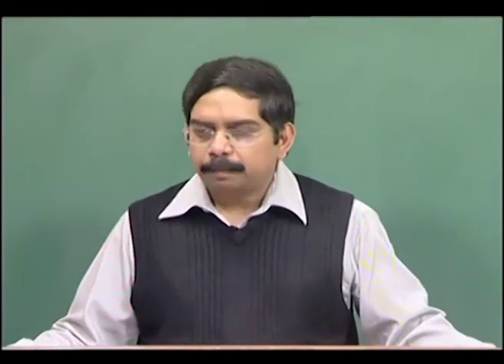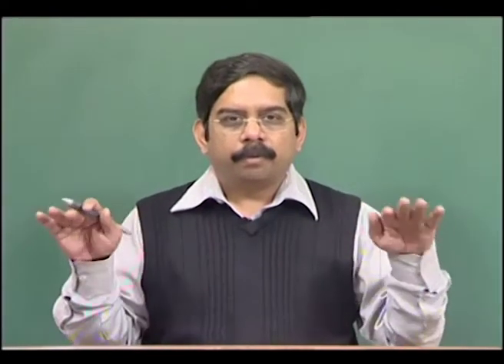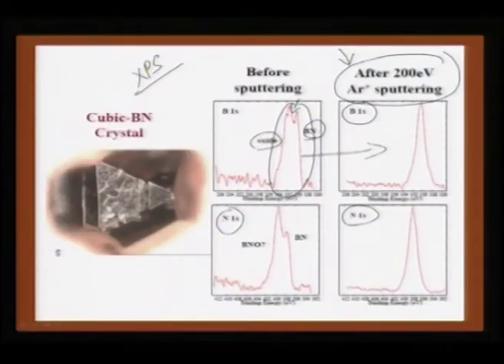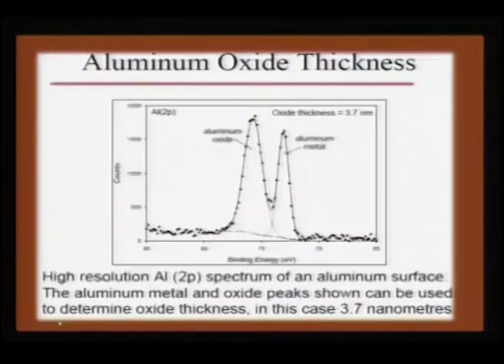Therefore, we need to be very careful to have a rough idea about such an impact of the sputtering ions on the sample. Therefore, if we look for mixed valency, then we need to be doing this in a much more careful way. But generally the argon sputtering will try to take out all the surface impurities which are settled on the sample.